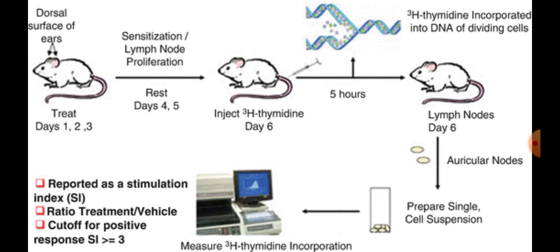It is the alternative approach to traditional guinea pig methods, as it also provides animal welfare benefits. There is no absolute conformity in the sensitivity or sensitization potential of a substance in mouse, guinea pig, and human.